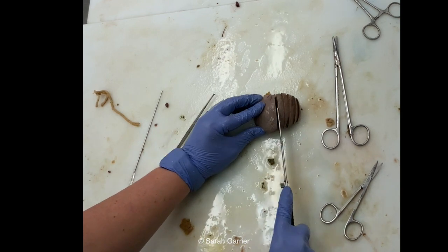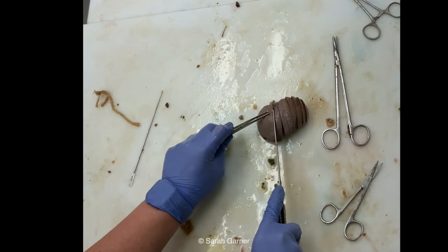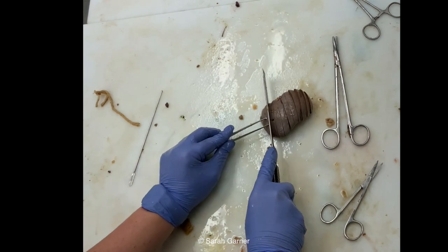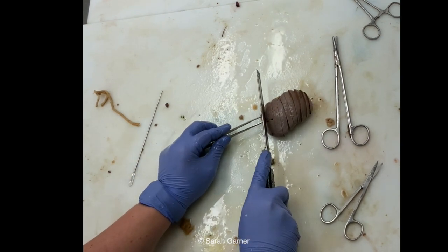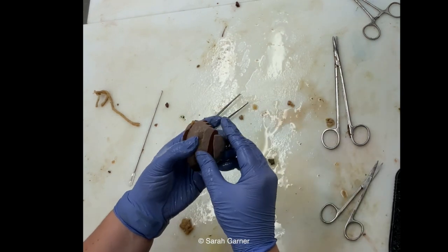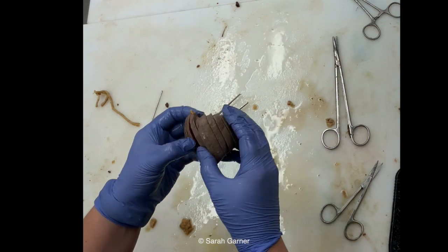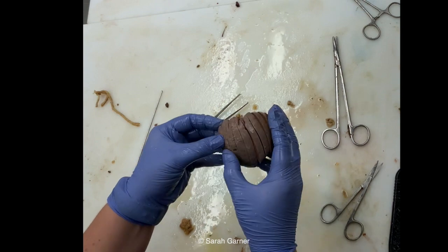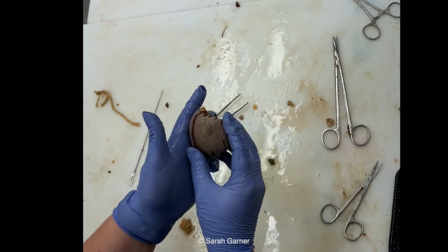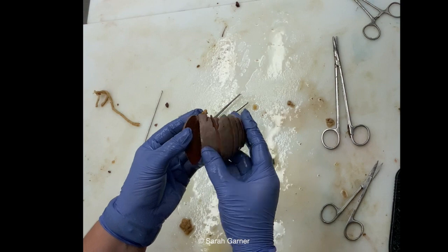Something that's important for surgical pathology specimens, and not as pertinent for autopsy, is noting the integrity of the splenic capsule. Oftentimes, especially in trauma cases, if that splenic capsule ruptures, the patient can bleed out. So it's a very important thing to note in your dictation, and it's typically considered a medical emergency. So spleen rupture is no fun, no good. But for autopsy, typically that's not going to be an issue. Forensic cases, yes, something you should note.